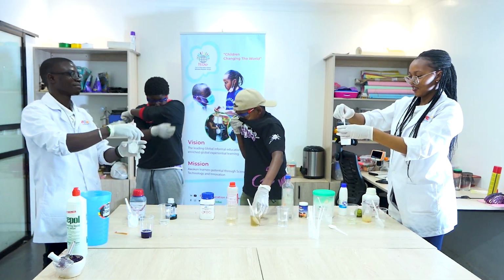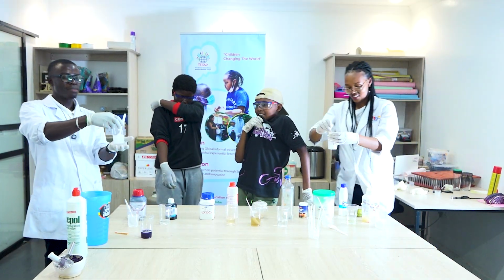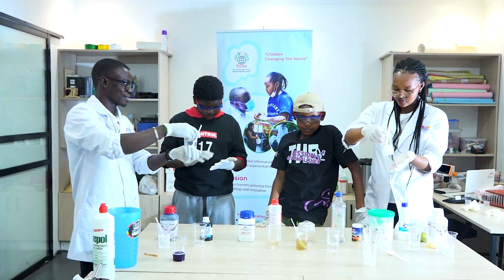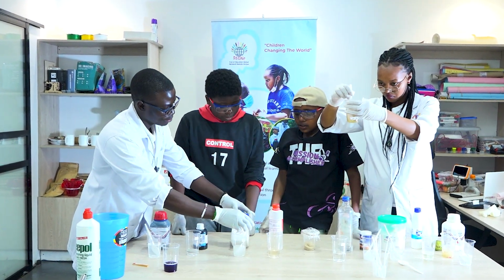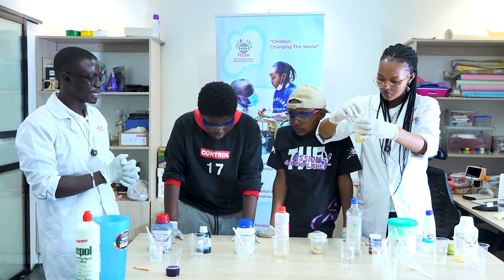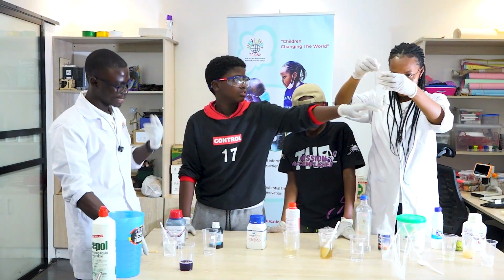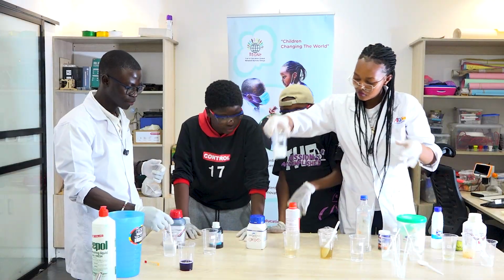Good. So, what's that smell? The sodium hydroxide. Maybe the team might just want to feel it also. It's very hot. It's very hot right now, but we don't have heat, remember? So that is sodium hydroxide pellets when dissolved in water. That is one fun part of it, because we didn't use heat, but some are already hot. Okay? Now, the second fun bit of it is we are just going to remove the spoons now.